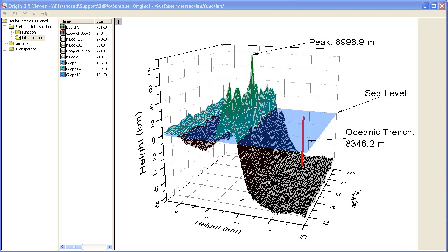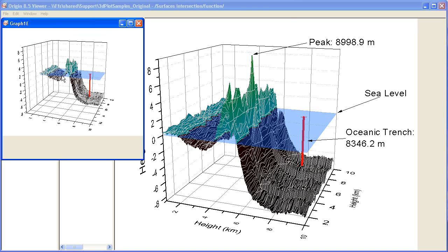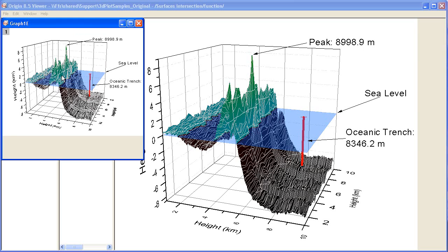Double-click on any of the graph icons in the Origin Viewer to open it as a separate window. Note that multiple graph windows may be open at one time, allowing them to be viewed on multiple monitors.